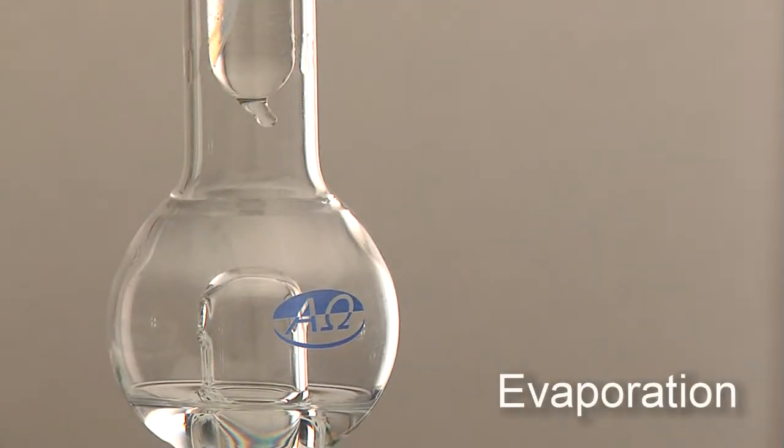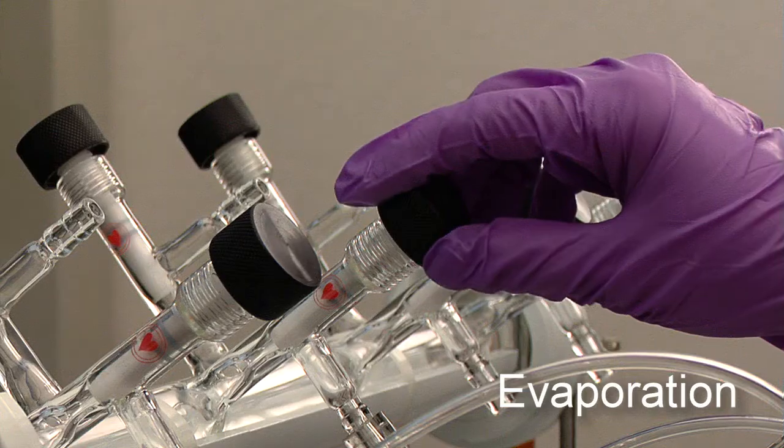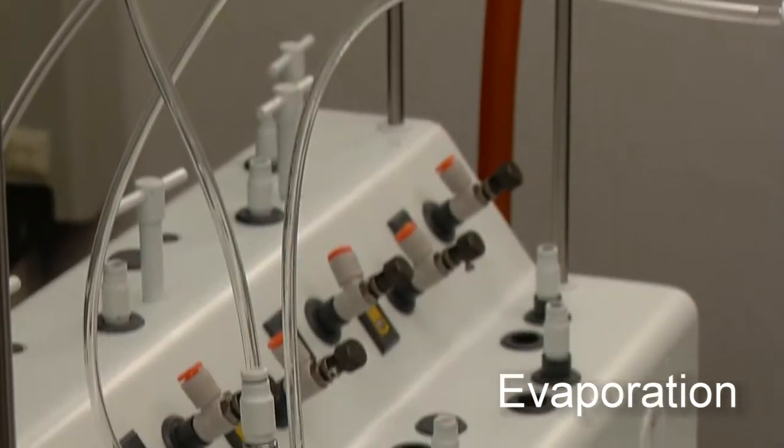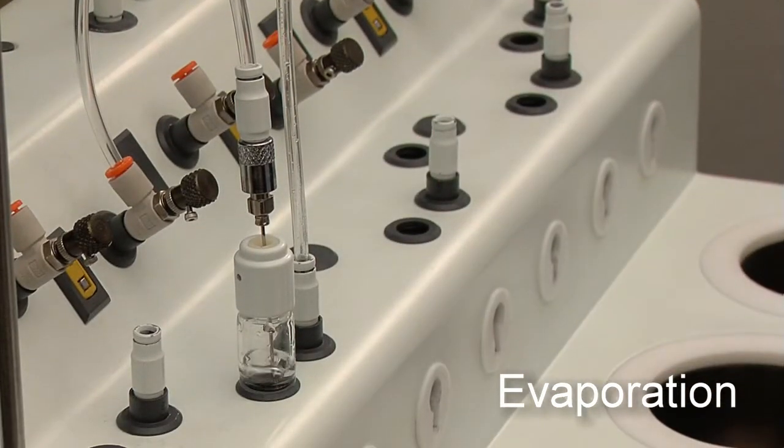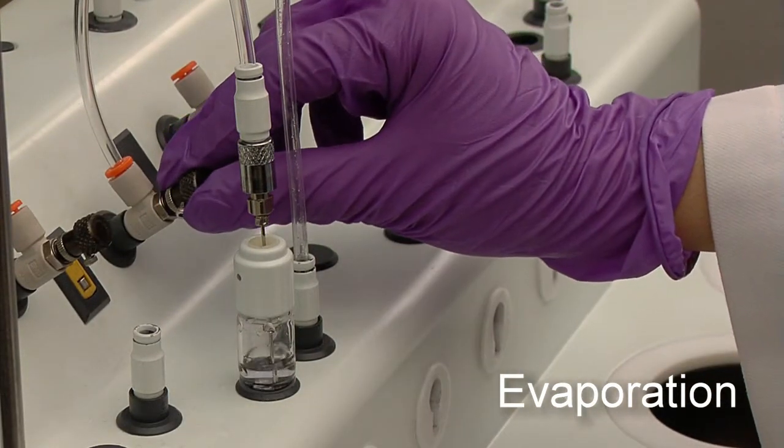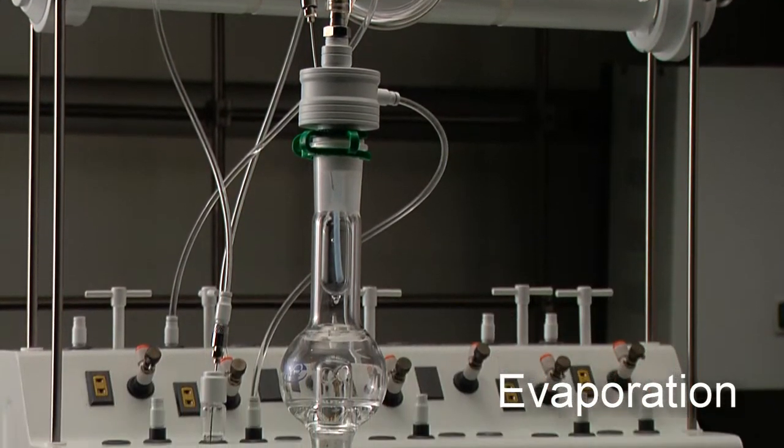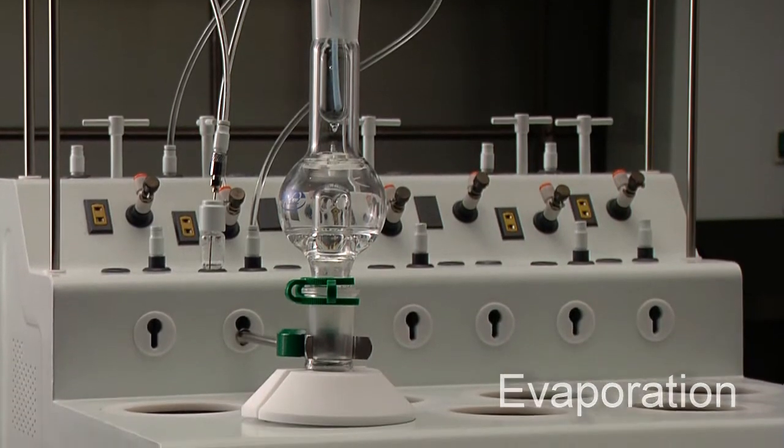Pro7 is able to conduct concentration to remove solvent by using the vacuum system, the inert system and the heating system at the same time. No cross-contamination can occur because the vacuum system and the inert system are completely separate.